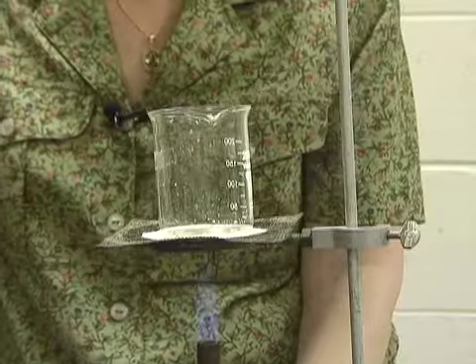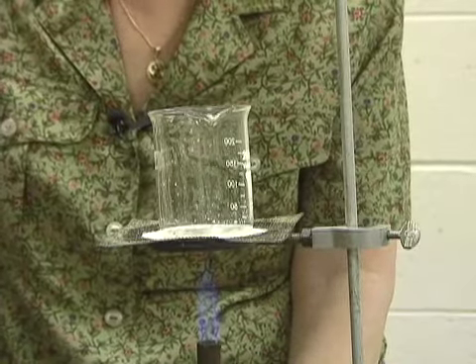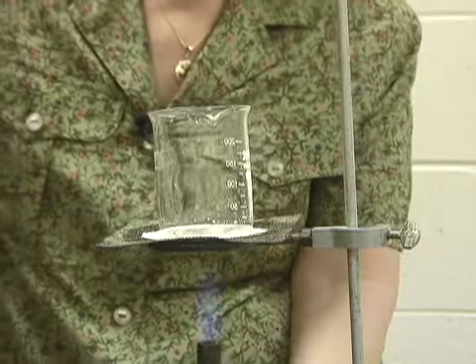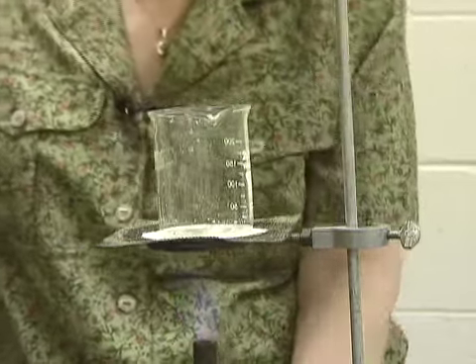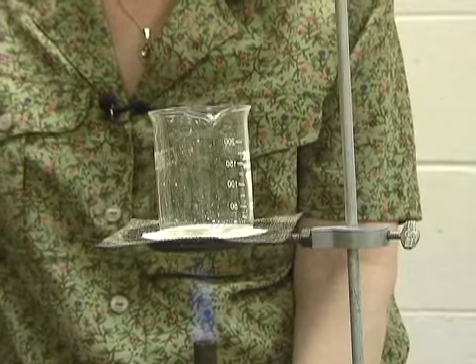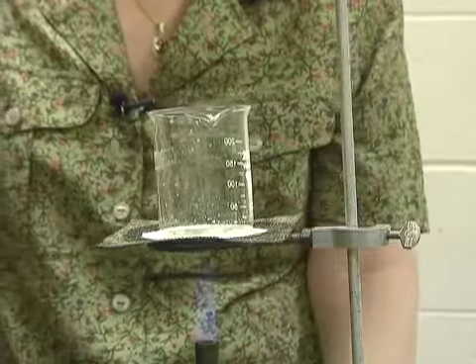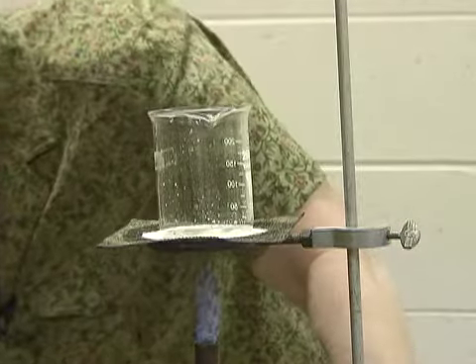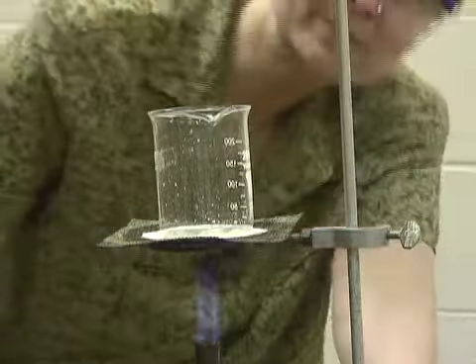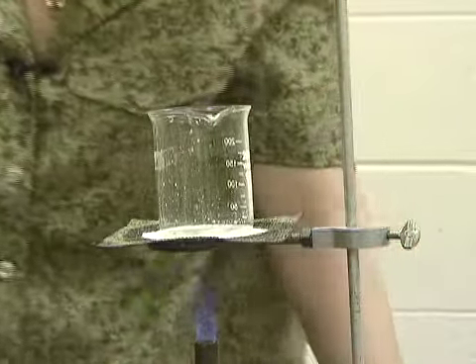And I see that the liquid on one side of the beaker is gone because it's bubbling down there on the bottom. And we're not that far away. I see that it's bubbling on the bottom there. Although I do see it is tilted a little bit, and there is more of the liquid on this side than on that side.